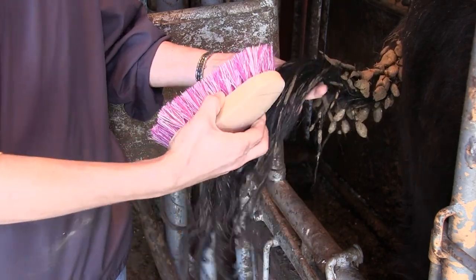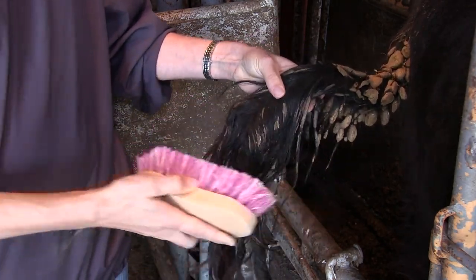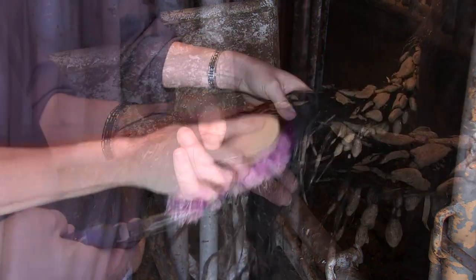First, if the tail switch is dirty, use your brush to remove dirt and other contaminants. Make sure the area is dry before collecting hair.